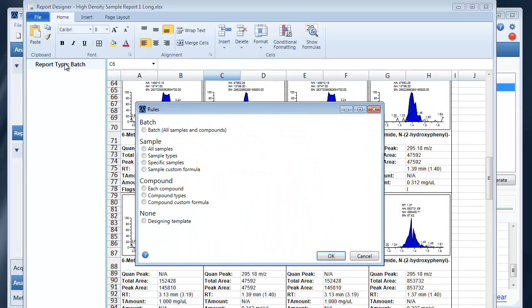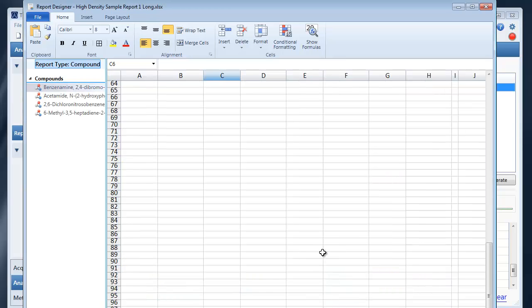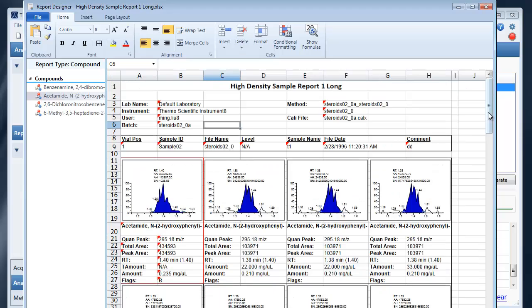If I switch to compound then you'll see a single compound with all samples.